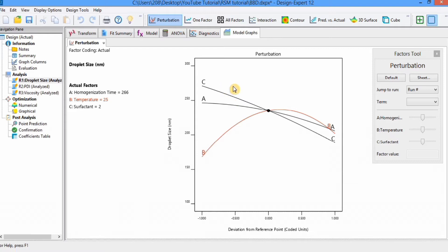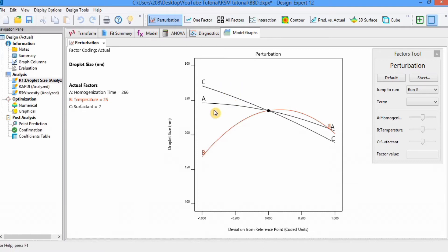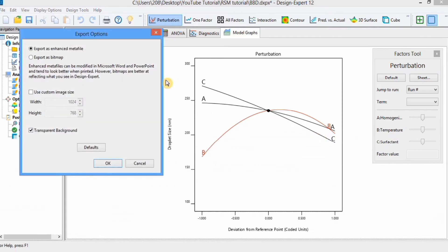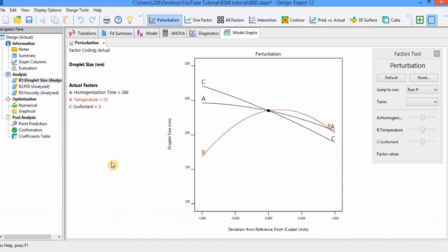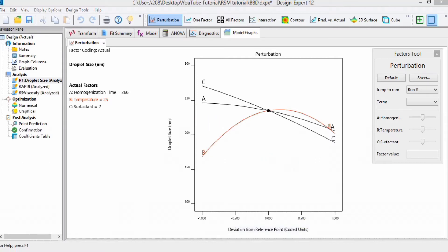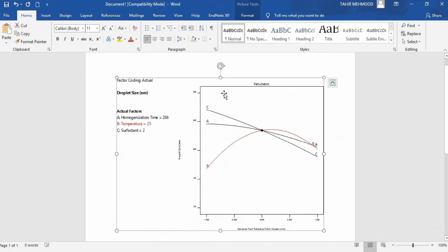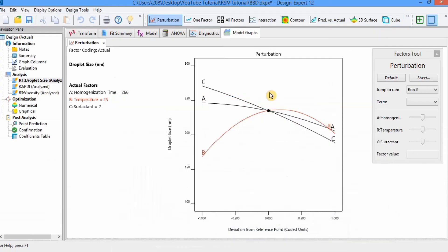If you want to export this graph to Word, simply right-click on the graph area, go to the export option, and select export graph to Word. Click on it, select export as enhanced meta file, and click OK. The graph will then be exported to Word. You can see the graph is exported and you can further edit it — crop it or use it as is. You can follow a similar procedure to export all graphs.